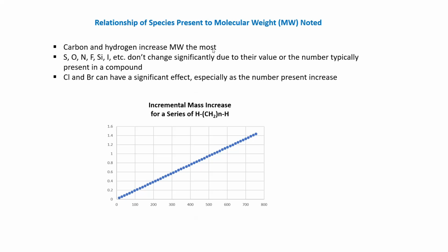And remember again, SciFinder has a fee. It costs money to do, while ChemSpider is free. But ChemSpider has fewer structures in it, and it's not as highly curated, and you can't search by keyword. But there are some advantages with respect to monoisotopic molecular weight searches. So I hope again that all this has been useful to you, and good day.